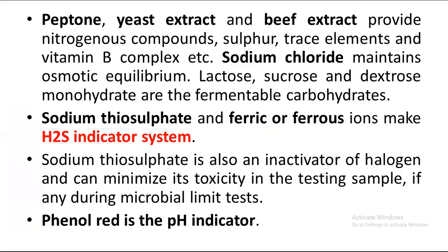Again, peptone, yeast extract, and beef extract provide nitrogenous compounds, sulfur, trace elements, and vitamins to the microorganism in order to grow. Sodium chloride maintains osmotic equilibrium, and lactose, sucrose, and dextrose are used for fermentation.